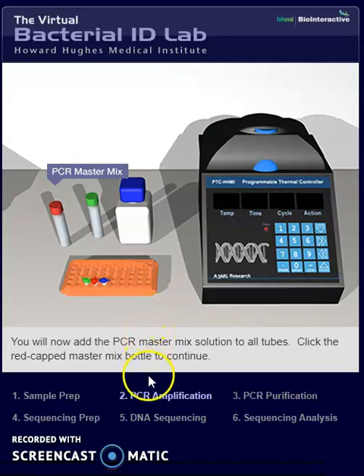After that, we will do step 2, which is PCR amplification. First, we will add the PCR master mix solution to all tubes.